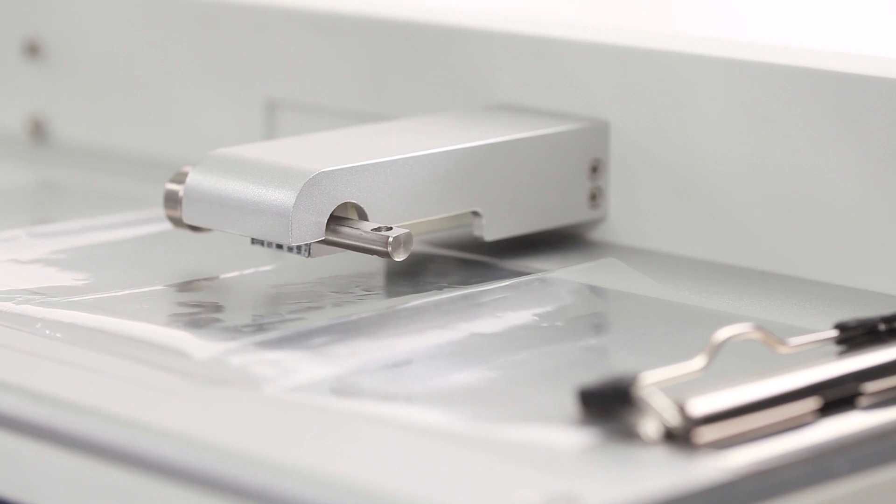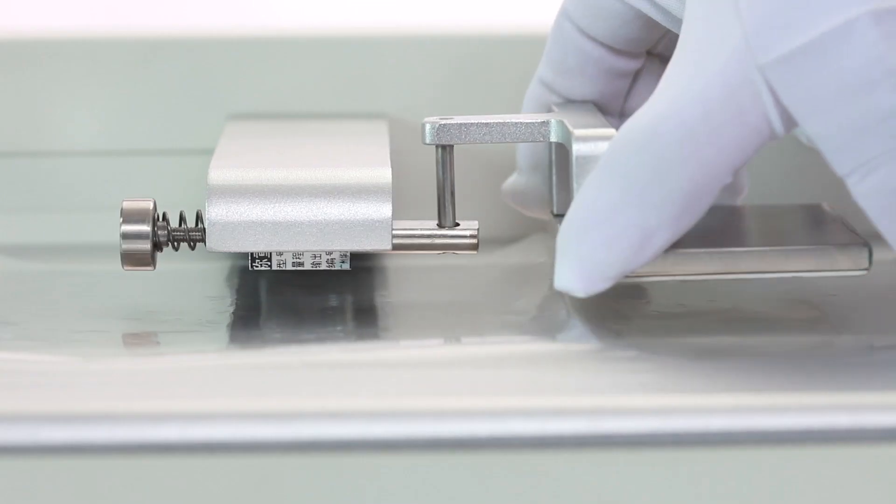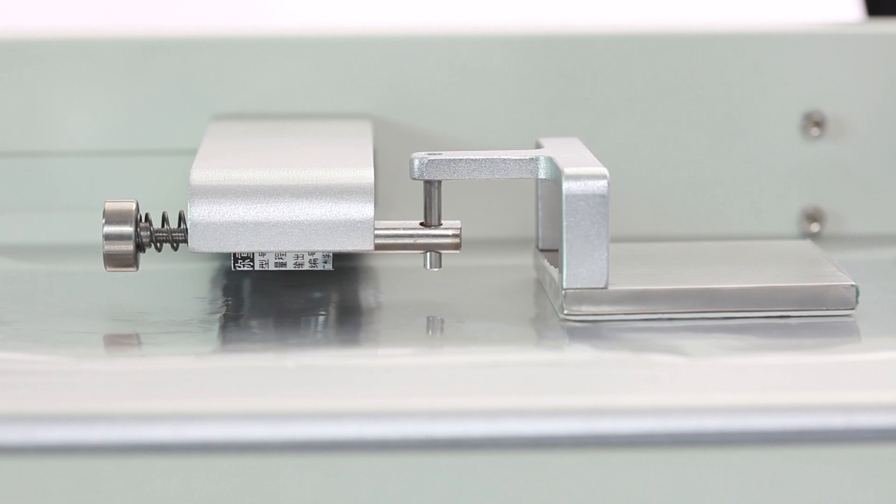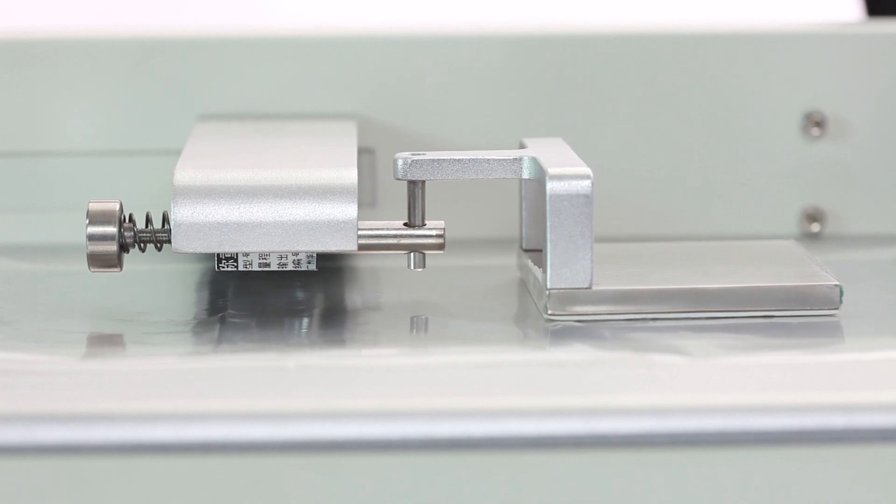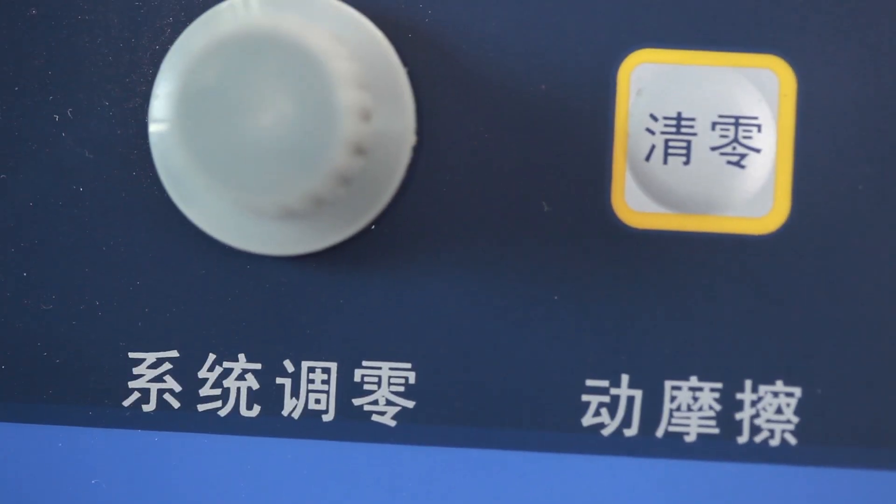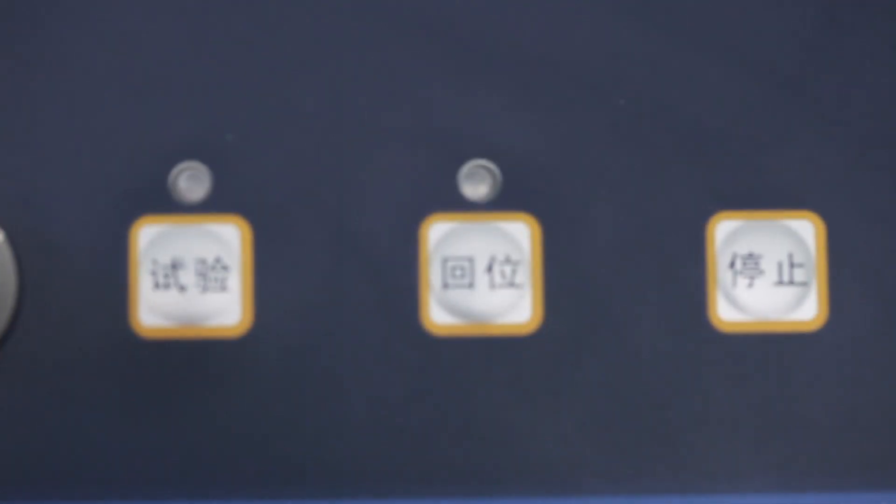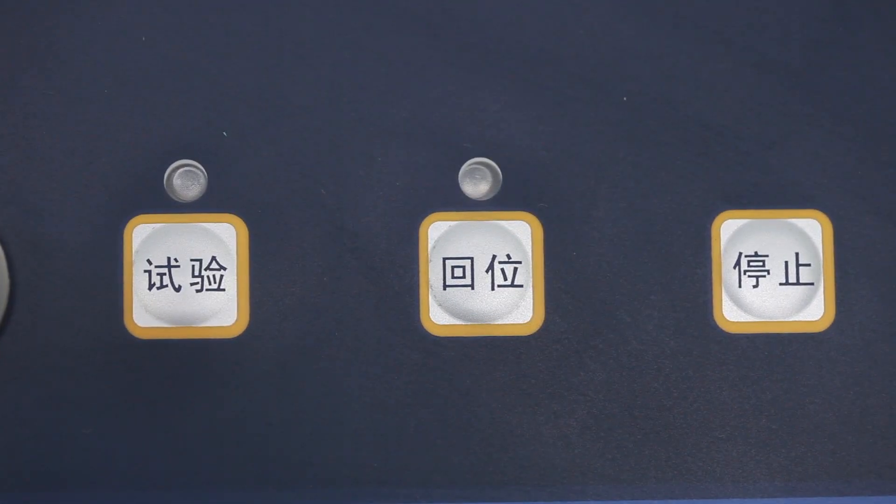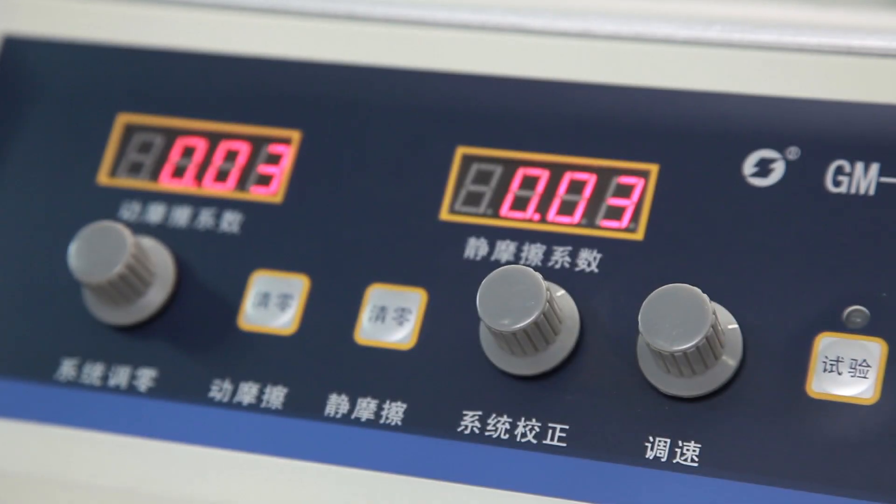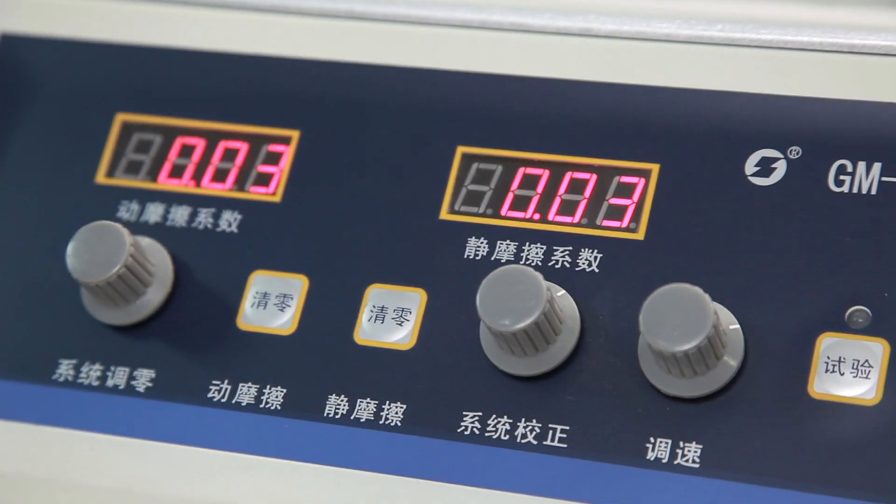Used in the industries of packaging, plastic film, inspection agencies and so on. It has excellent stability and repeatability, high precision, and is easy to use.